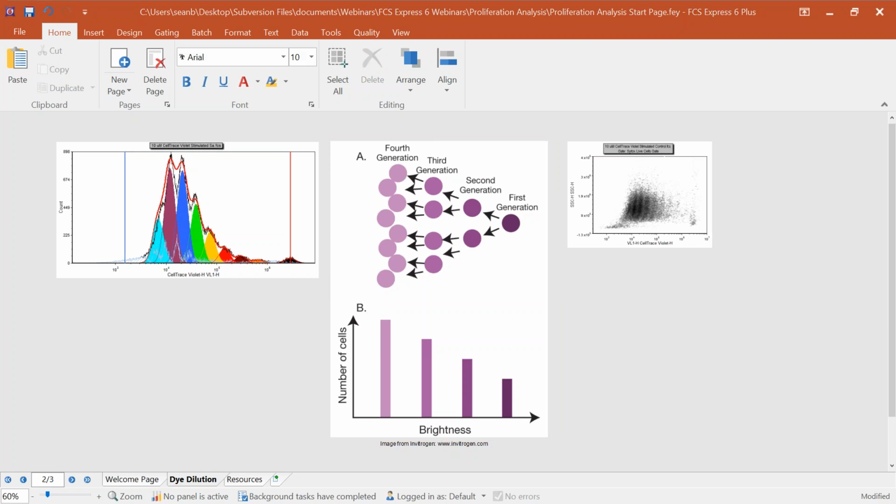After staining, these cell populations are analyzed at regular time intervals by flow cytometry or at an endpoint. A histogram of the number of cells as a function of the dye fluorescent intensity can be generated. Typically, cell proliferation dyes can be used to track up to 8 rounds of division before the fluorescent intensity is reduced to the autofluorescence of the unstained cells. Just because you add more dye to these cells isn't necessarily a good thing. Sometimes when you add a lot of CFSE, the cells may die and you may run into other problems.